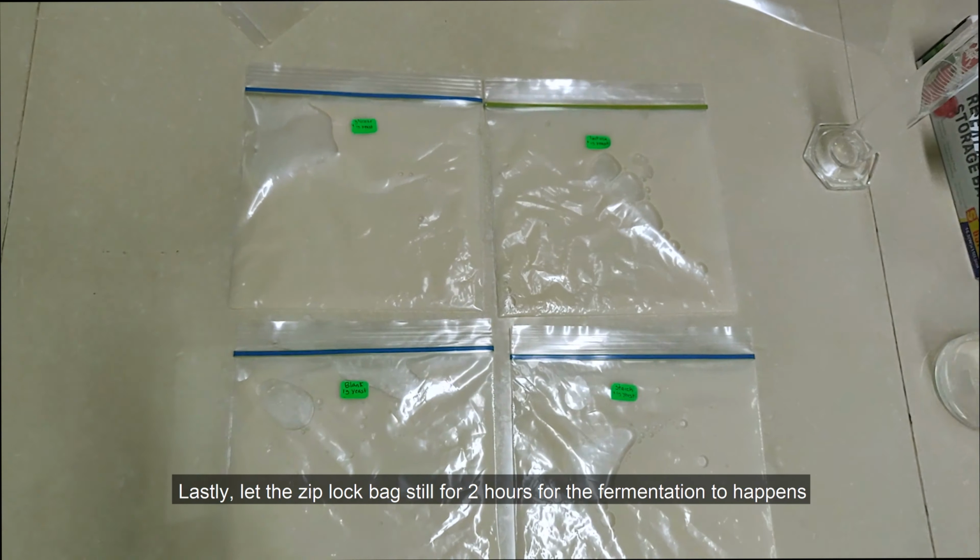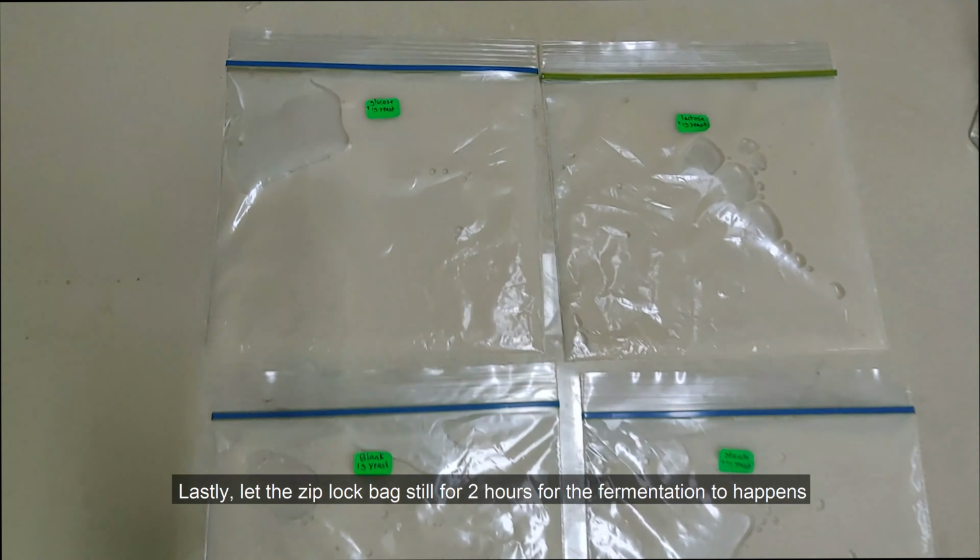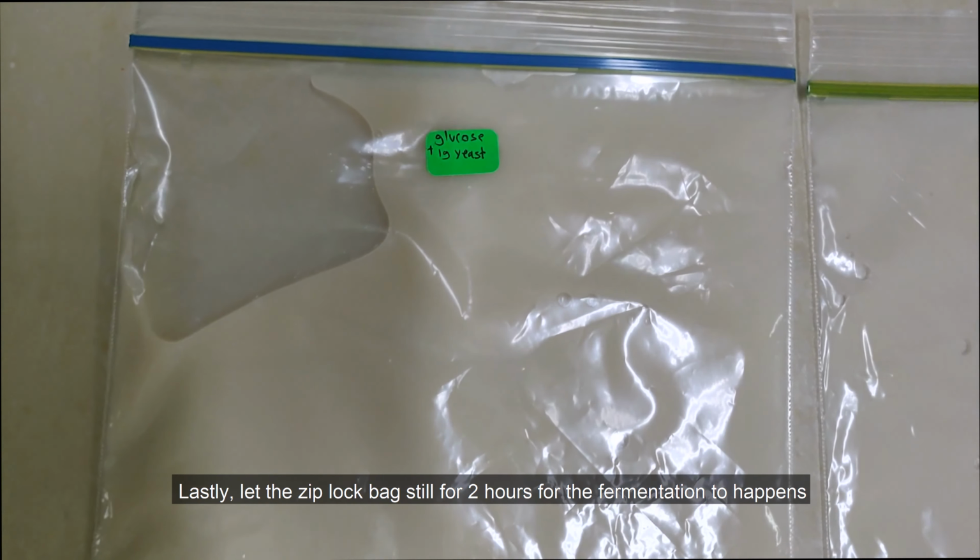Lastly, let the Ziploc bags stand still for 2 hours for the fermentation to happen.